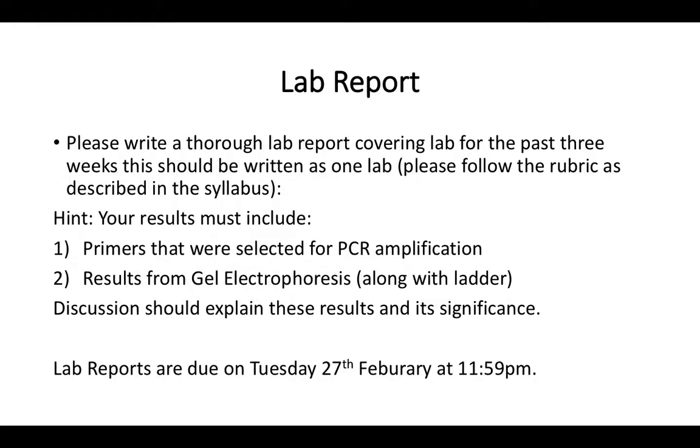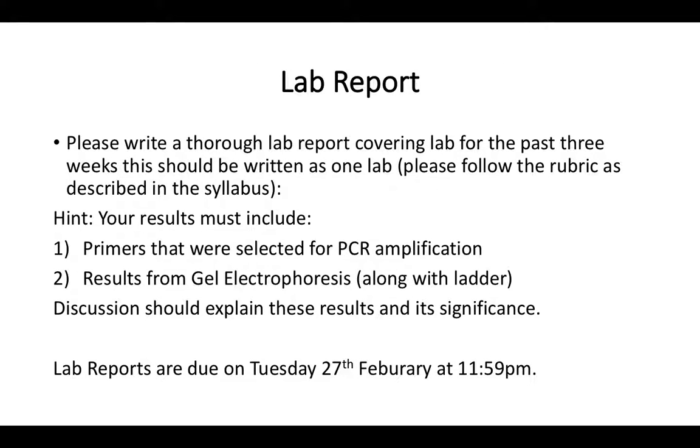And for that, you selected for PCR amplification, of course. And also part of the results, we need the cartoon ladder that we see on the extreme left here, and also our actual image of our gel, right? And in your discussion, you should explain these results and the significance of these results. So we have 1 week to actually write this lab report. It is due on the week of the 27th. So that Tuesday night in February at 11:59 is when our lab is due.